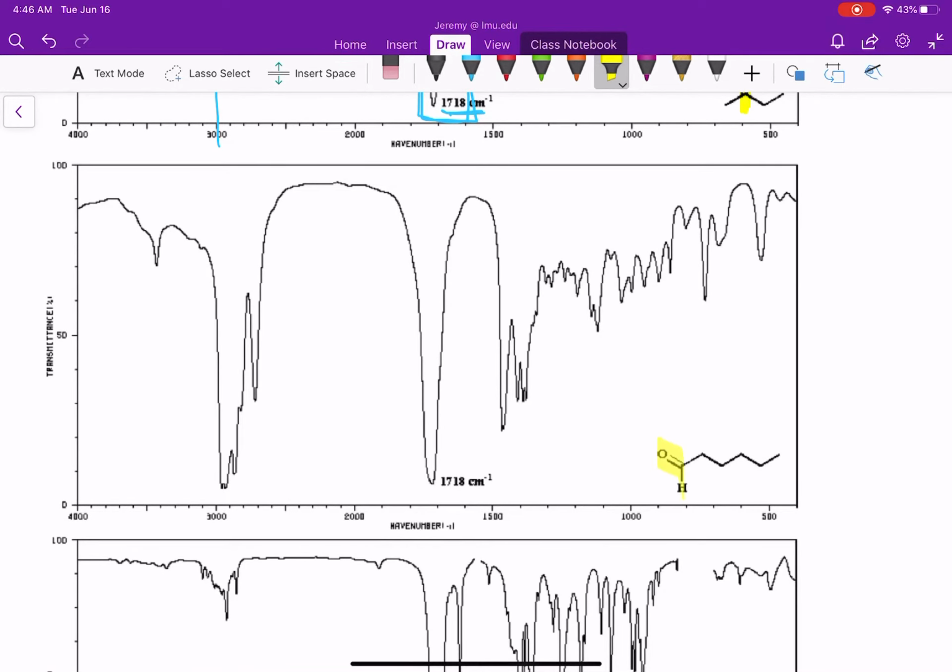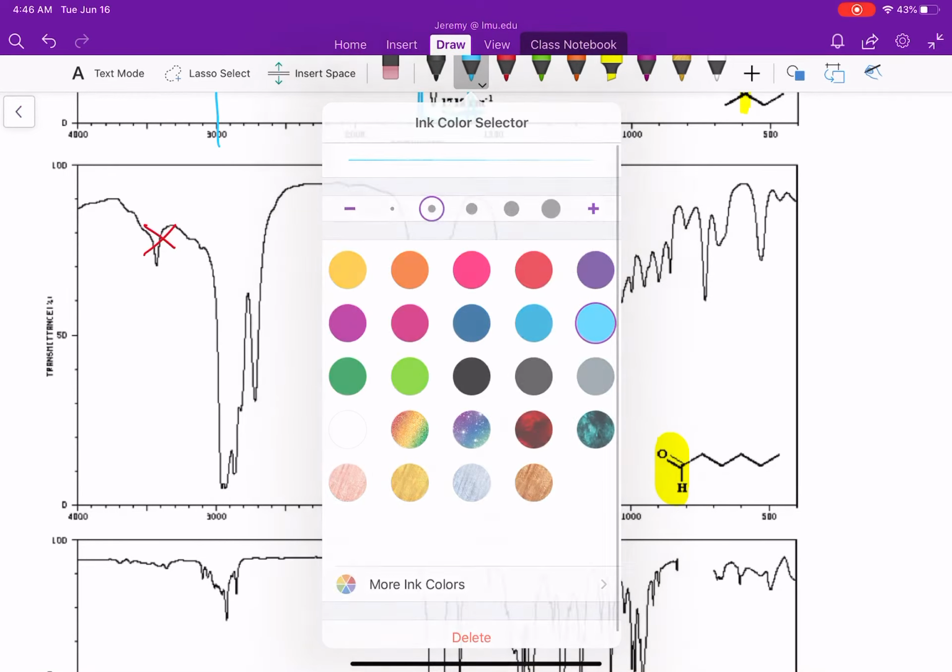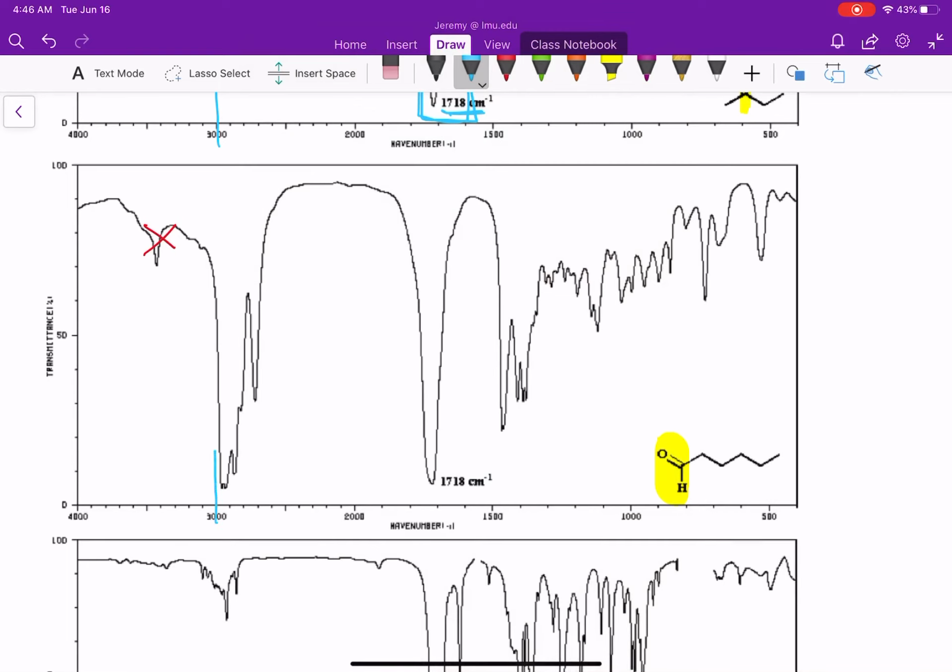Next, we have a functional group here. We have an aldehyde. Here we can definitely distinguish this. As we go through zone 1, there's a tiny peak we ignore. We look at zone 2. I draw my 3000 line. I circle my peaks from 2850 to 3000. Those correspond to sp3 C to H's. And now I have this other peak way out by itself at about 2700.